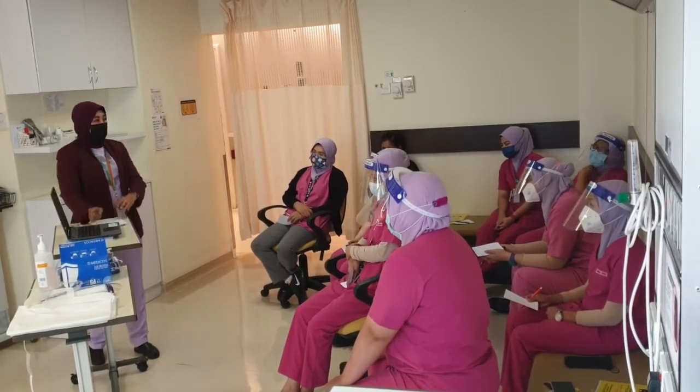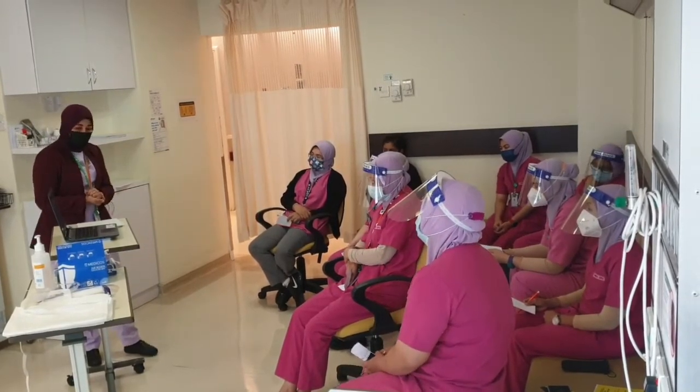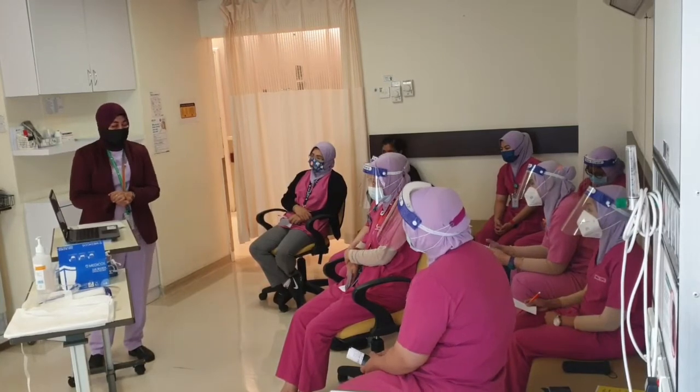So after you don, you need to do doffing. That means throw away everything, your PPE. So now we do proper doffing of PPE.